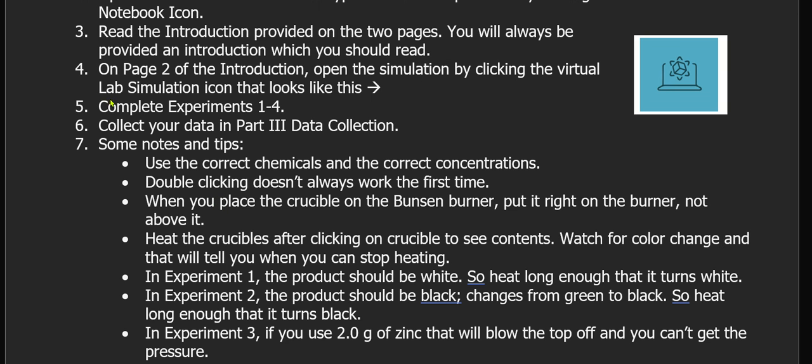So in this lab, you will be completing experiments 1 through 4, and then you'll be collecting data as always in this handout that I'm showing here in part 3. So some notes and tips, and then I'll go into a few more reminders and tips when I actually open up the lab sim.